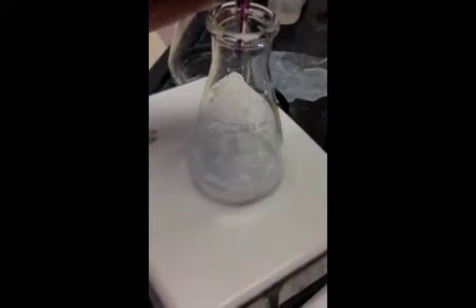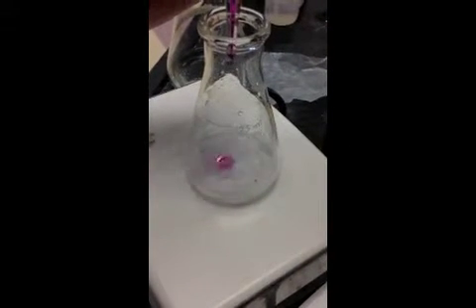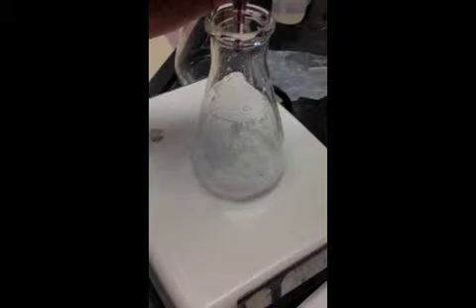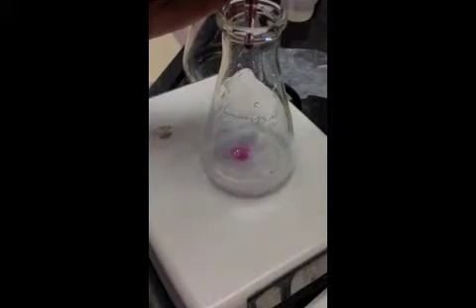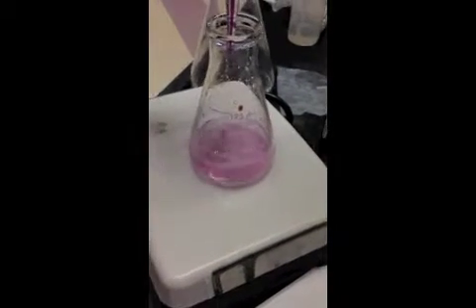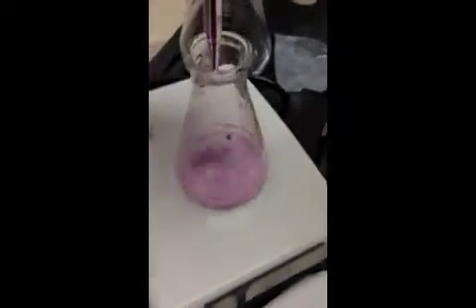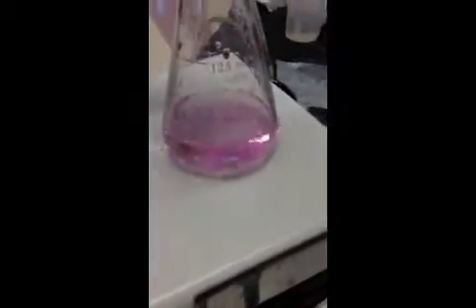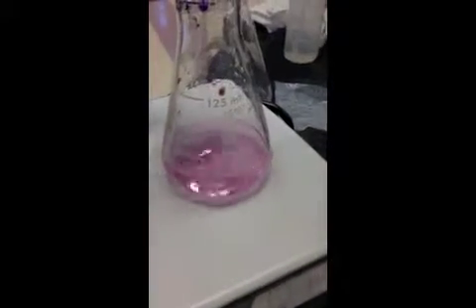As you can see, the pink color is initially seen but then fades away, indicating that the equivalence point has not been reached yet. After the pale pink color is reached, make sure that you wait 30 seconds while it's stirring to ensure that the color does not fade.